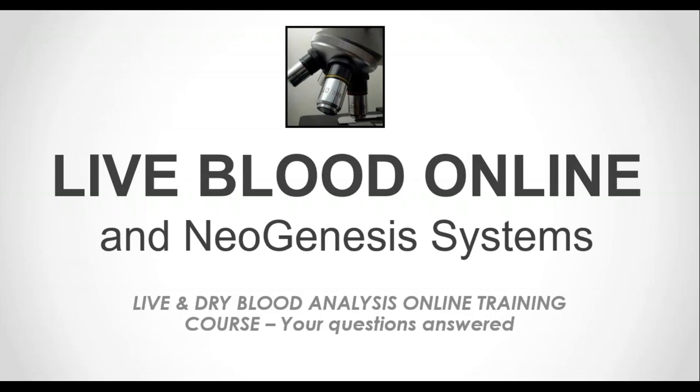So most commercially available dark field microscopes don't have the necessary specifications. So this is a potential pitfall where you will not be able to see all the anomalies that you've learned about with a standard type of dark field microscope. So we've researched this extensively.